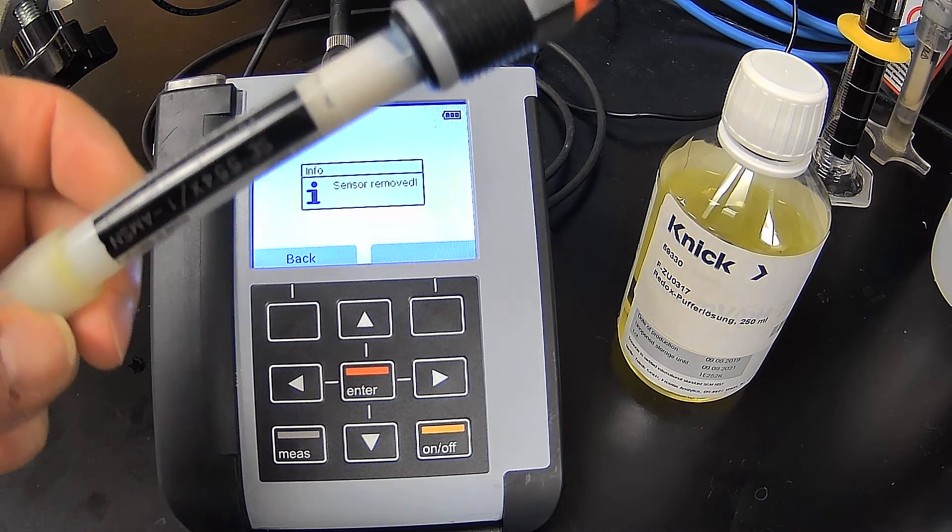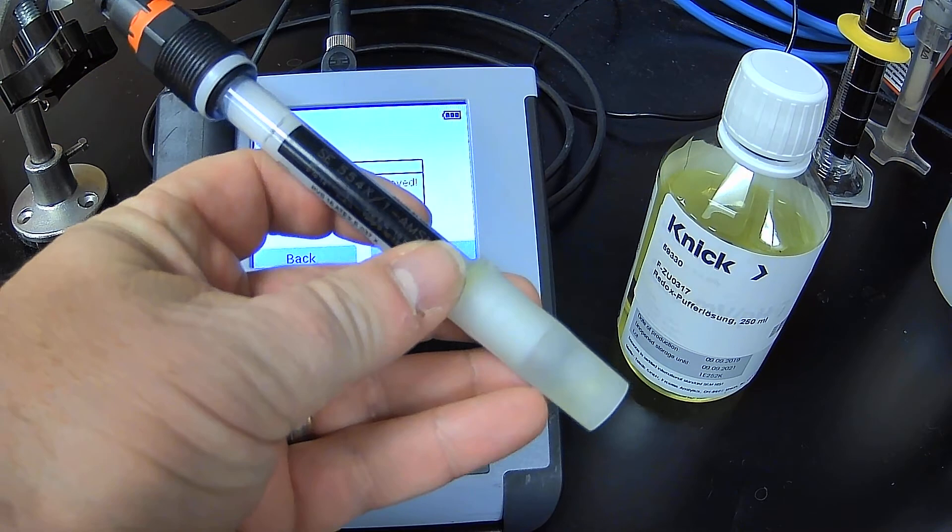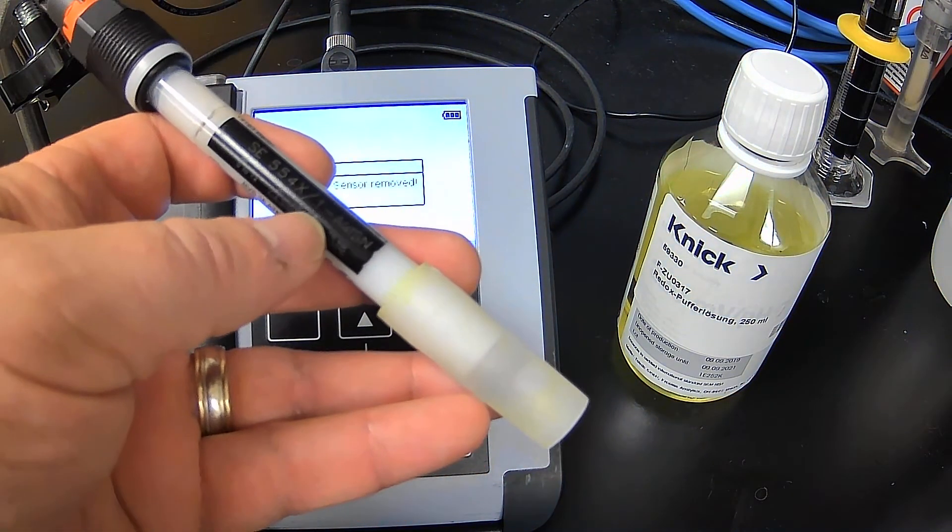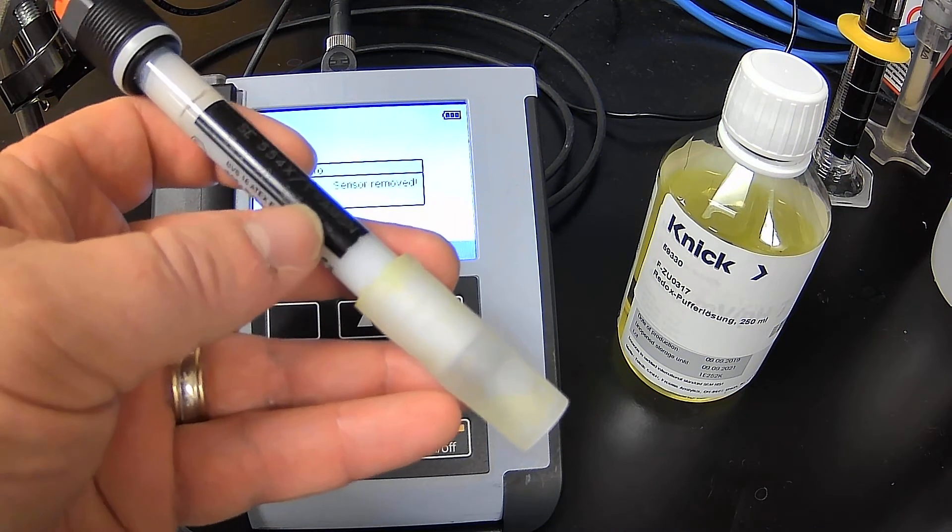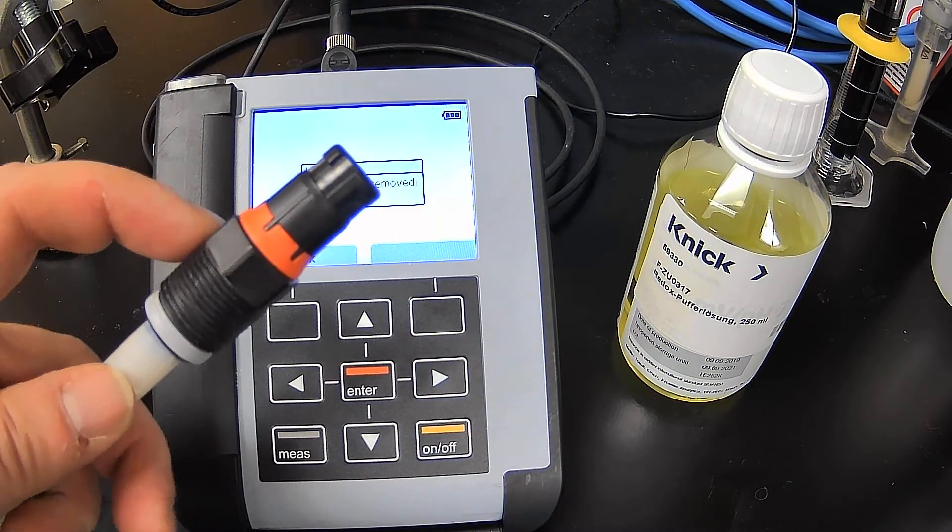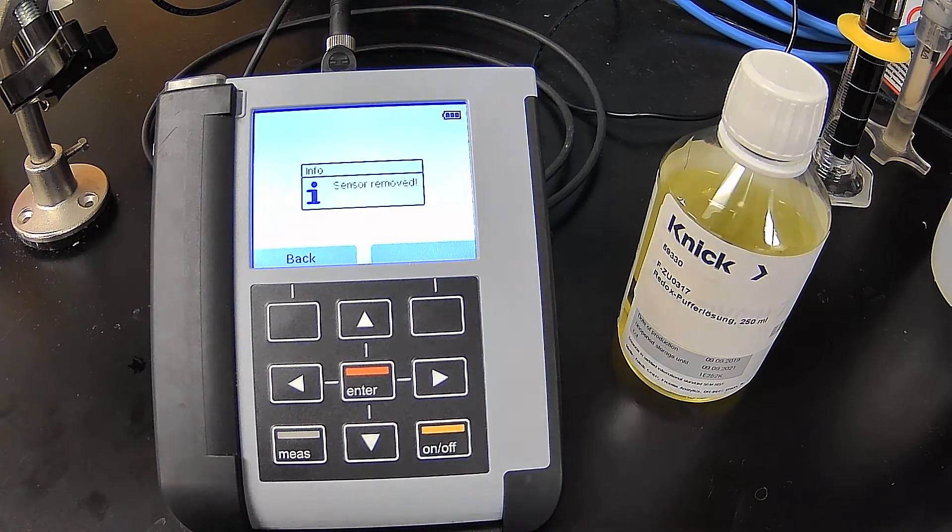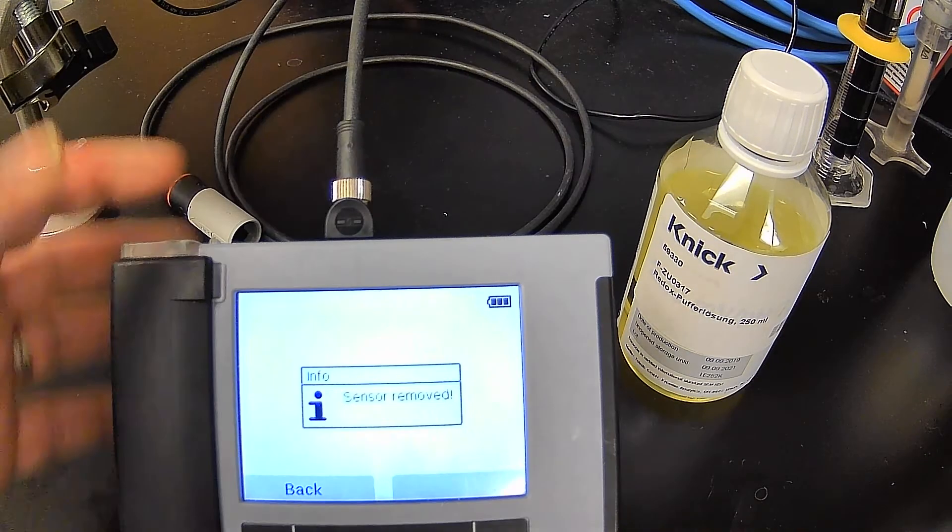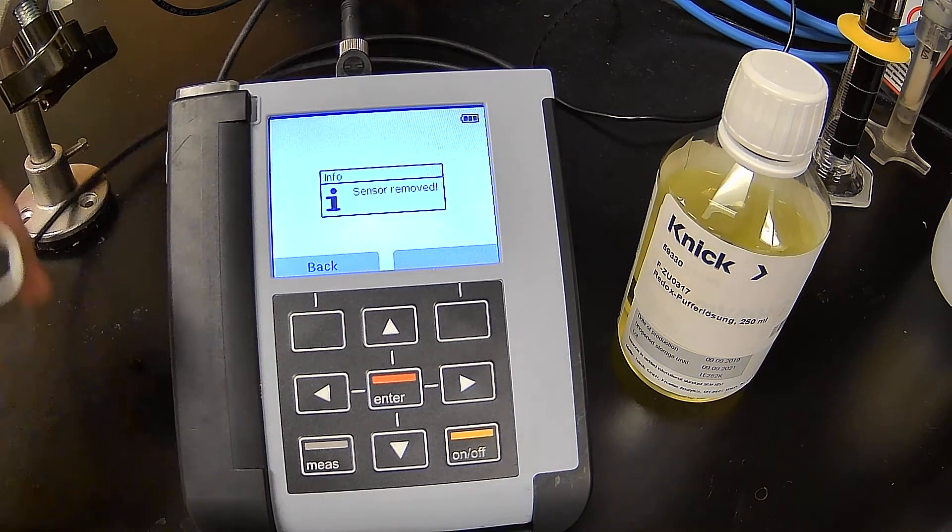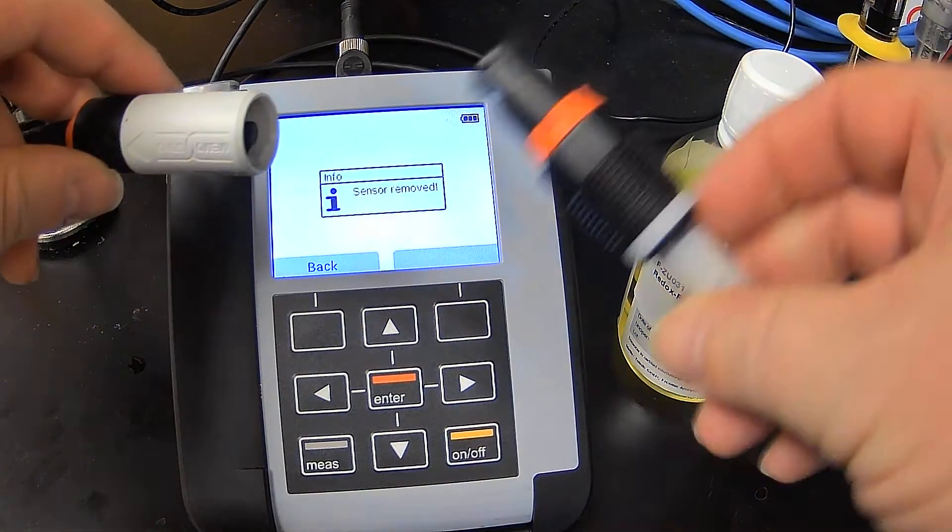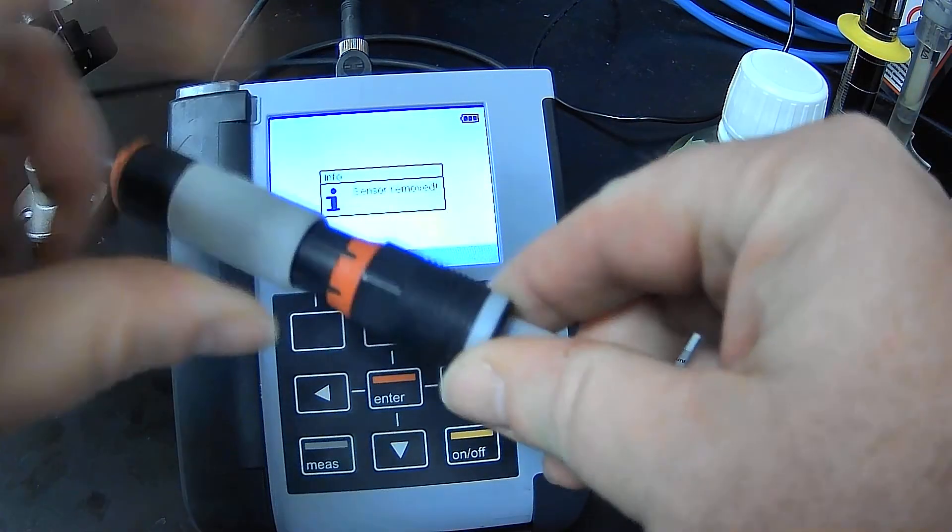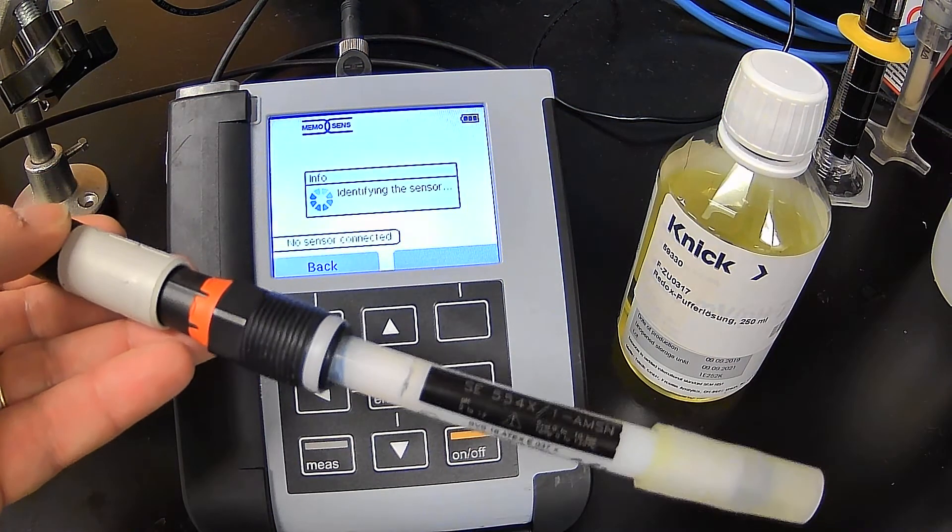The electrode that we're going to use is actually an SE554 AMSN combination electrode, which is pH and ORP. It is a Memosense, and as you can see here, we have the cable plugged into the top, and then we have the other end of the cable right here, which connects onto the electrode, the SE554 combination.